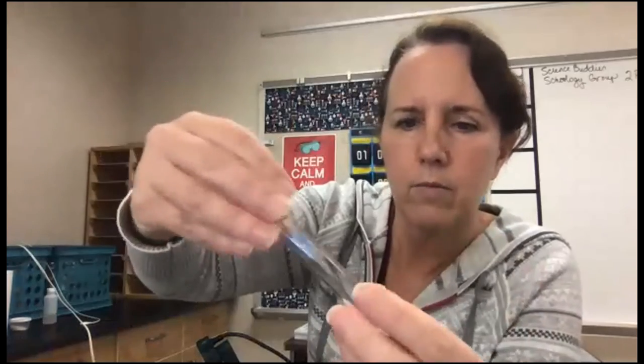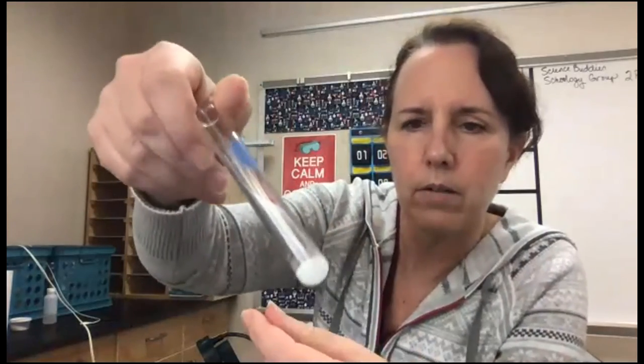I will tell you that things that melt high, it's much higher than 100. And things that melt low, anything that melts below 100 is considered very low melting. So that's B. Oh, and it's turning back into a solid, like you can see it. It's cooling back down. That's B, so it's re-solidifying. It's still warm a little bit, but it's cooling back down.